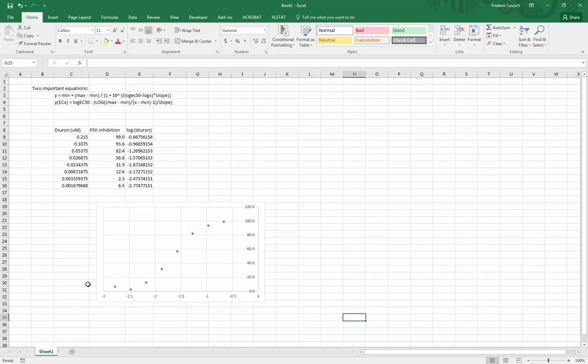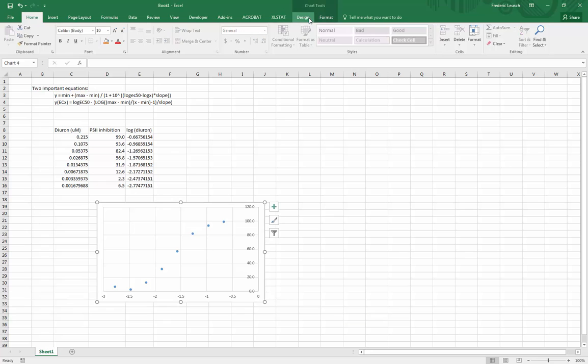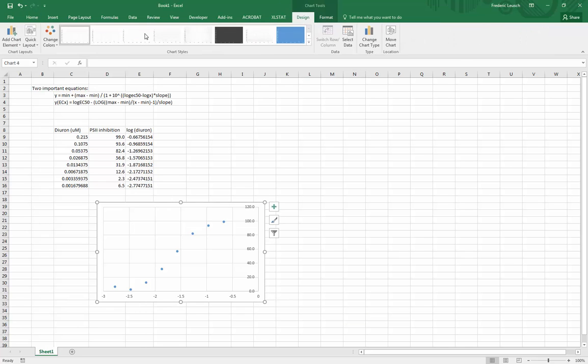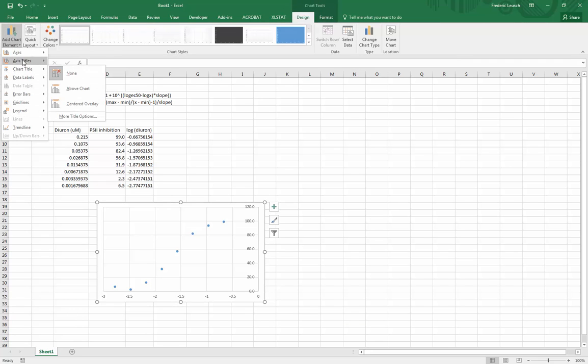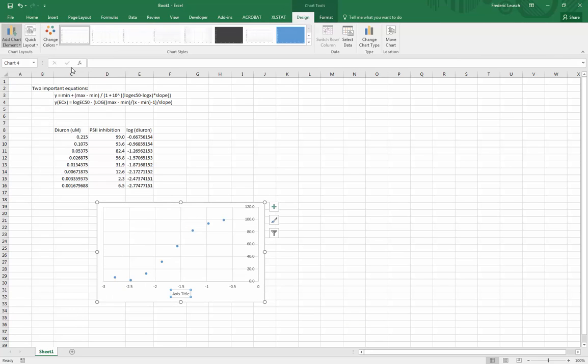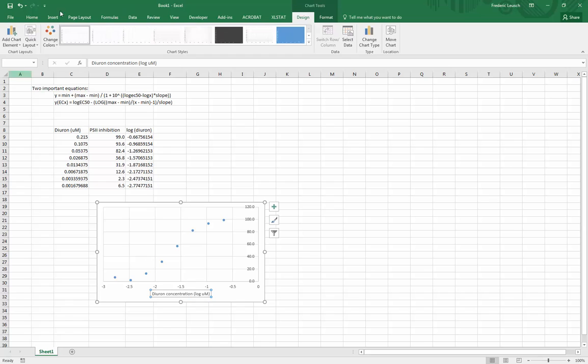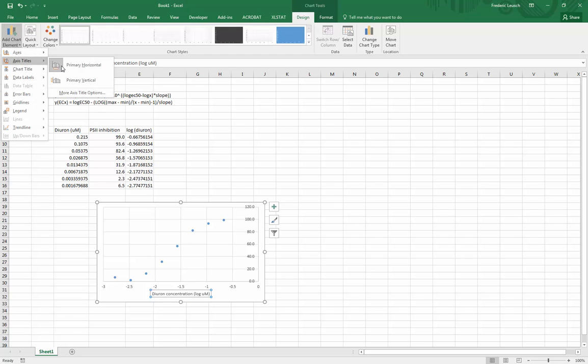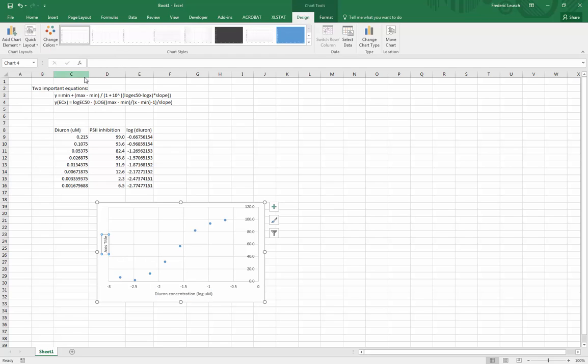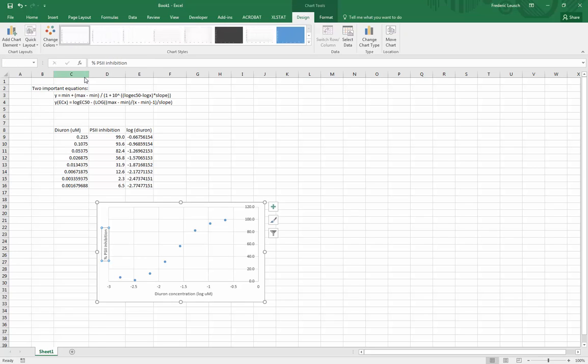So here I get this nice little s-shaped curve if I plot the photosynthesis inhibition versus the log of my concentration. I'm going to add my axes just as a normal good approach to science. So this here is diuron concentration log of micromolar and on my other axis is the % PS2 inhibition.